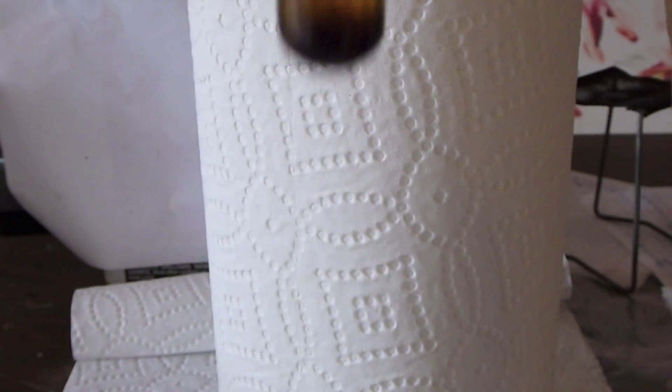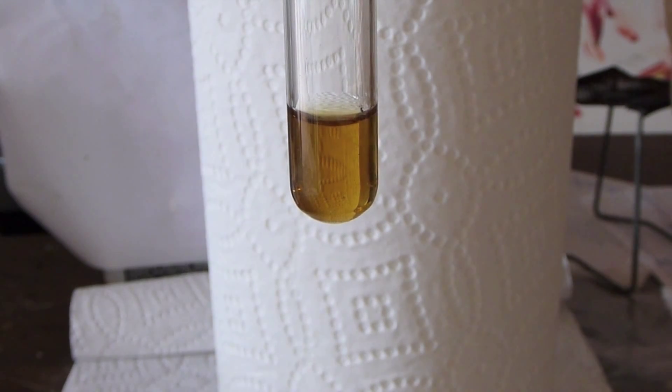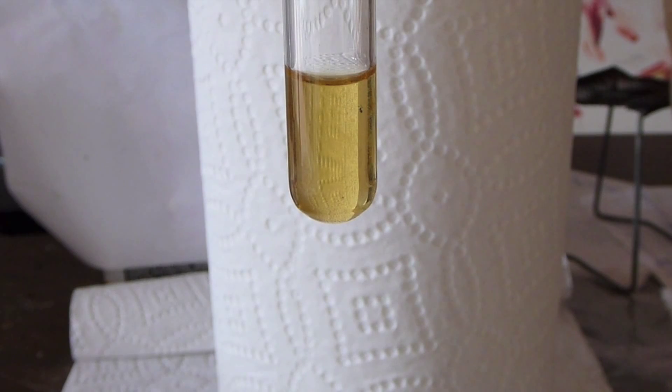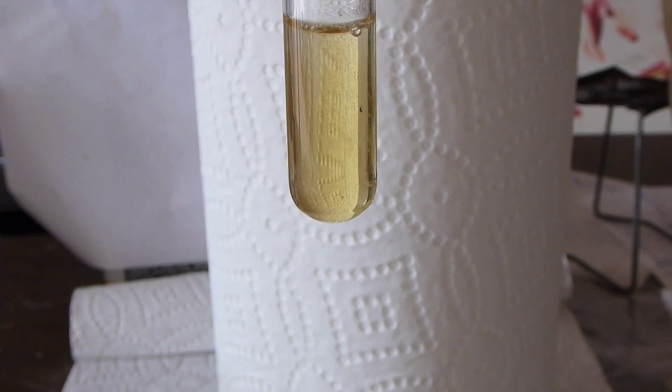I'm not 100% sure, but here is my best theory. I haven't been able to look up the reduction potential of ruthenium tetroxide online, but because persulfate is such a strong yet slow oxidizer, I think that the persulfate oxidizes the ruthenate to perruthenate, and then continues to oxidize the perruthenate to ruthenium tetroxide, which features ruthenium in the 8 plus oxidation state. Quite an unusual oxidation state for a single element, especially given that it isn't in any kind of fancy complex.